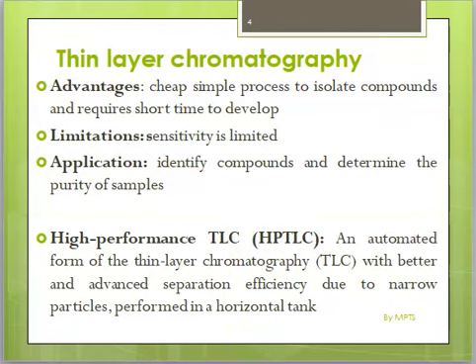I think here I forgot the description of the chromatography. The TLC, where we have a beaker with the TLC plate, where you put a line, and then you put the solvent, and it moves along the TLC. What are the advantages of thin layer chromatography?